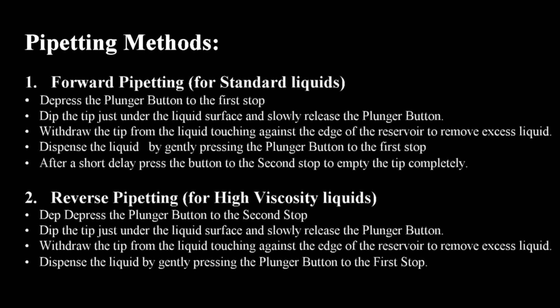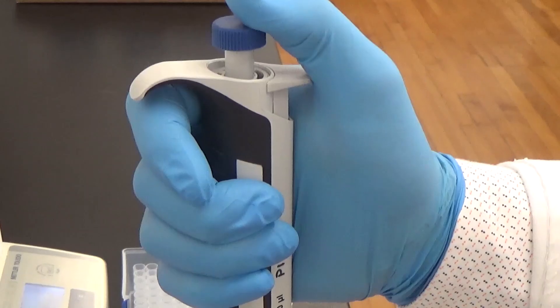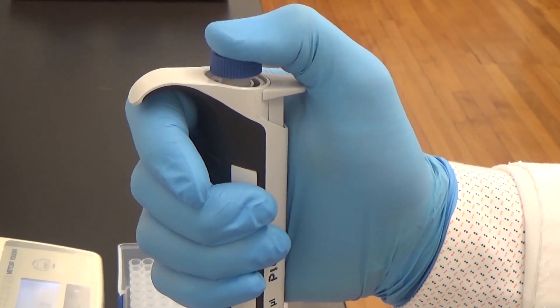There are two pipetting methods. Forward pipetting is used for standard liquids as reverse pipetting is used for high viscosity liquids. First, we'll be talking about forward pipetting.